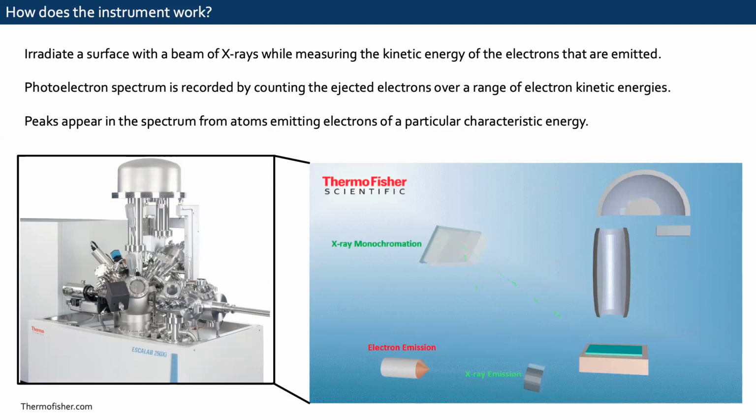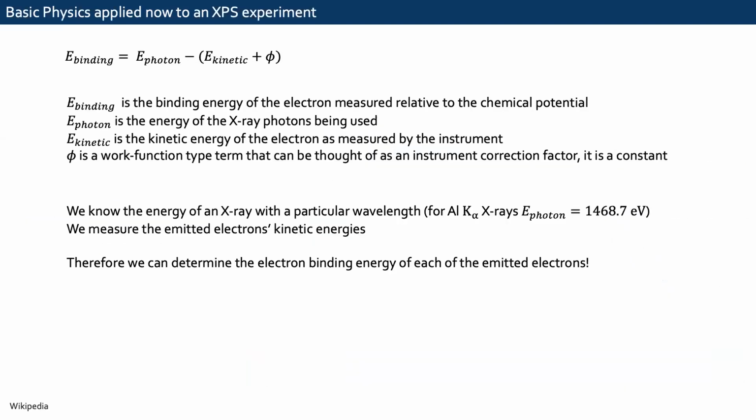Oh, one more point. For anybody who doesn't know what the word monochromation means, really all it means is that it makes it so everything is one same wavelength. Exactly. Like Kira explained, basically, if you don't have one single incident photon energy, then your spectrum doesn't mean anything, because all of the different energies are possible from the different constituent elements.